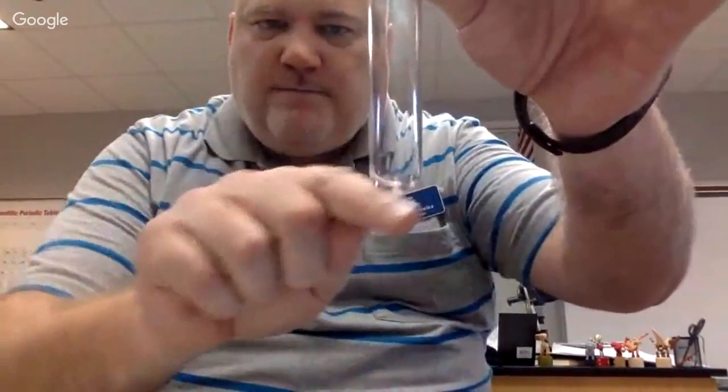So if you take a look at a test tube, see how the bottom is rounded? So these 2 groups over here, and by the way, for those of you that are watching, if I'm not here, you're going to divide yourselves into even groups, and they're going to be at these 5 stations. The 2 groups over here, you're going to measure from the very bottom of the curvature: 1 centimeter, 2 centimeters, 3 centimeters. The 3 groups on this side of the room, you're going to start where the curvature starts and start measuring from there: 1, 2, 3. So you're going to ignore the curvature on the bottom in terms of the copper sulfate.